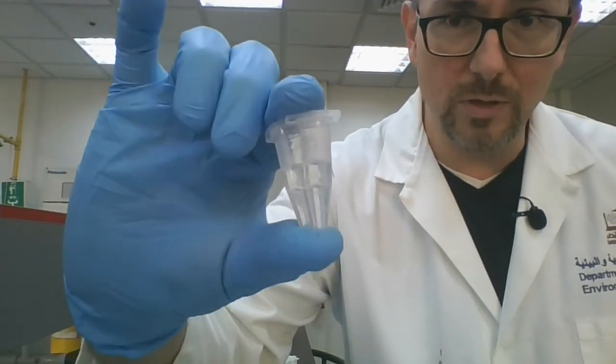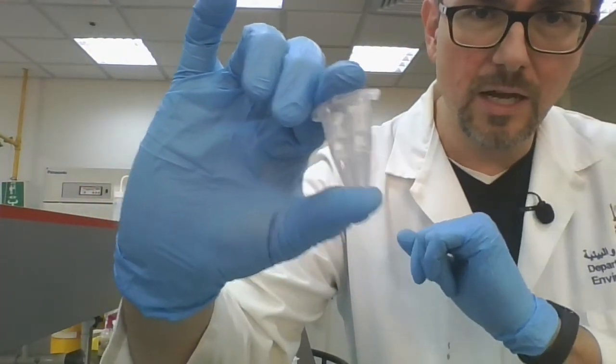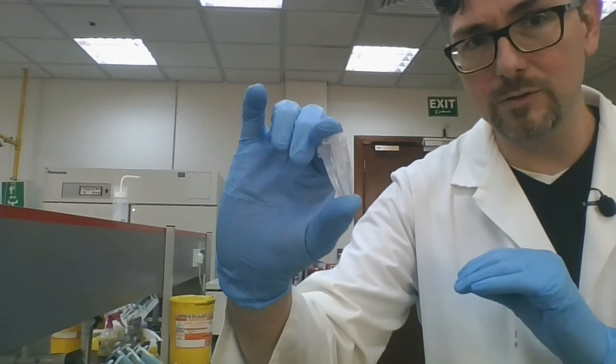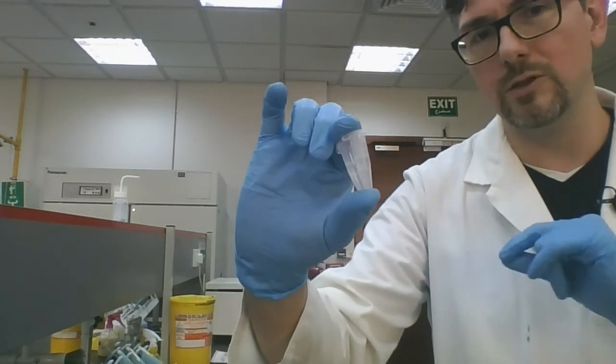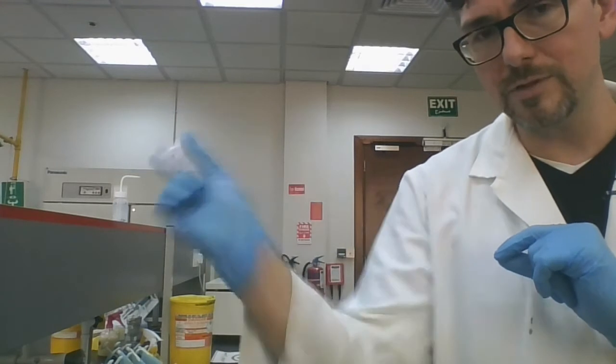So basically what I want to do is make sure that any proteins that might still be in that aqueous phase are going to come into contact with the organic phase. And a lot of the proteins will stay dissolved in the organic phase. In this way, we can actually remove most of the proteins that might still be contaminating our sample.